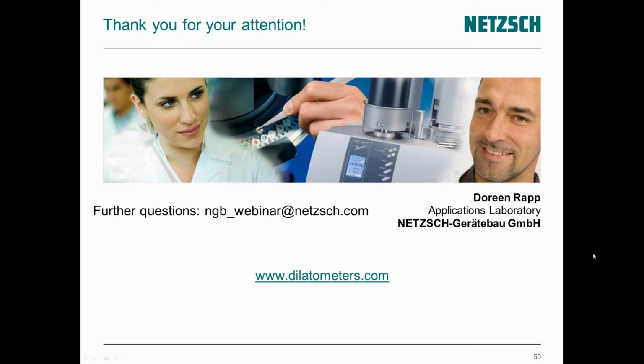One question regarding the purge gas. Yeah, maybe you recognized in many slides, helium was used as a purge gas. So the choice of purge gas depends on the measuring range, on the temperature range, as well on the sample itself. So we use mainly helium because helium has the best thermal conductivity in comparison to other gases except hydrogen, but hydrogen is something which you do not want to use in your lab. So therefore we use helium, especially for low temperature ranges.